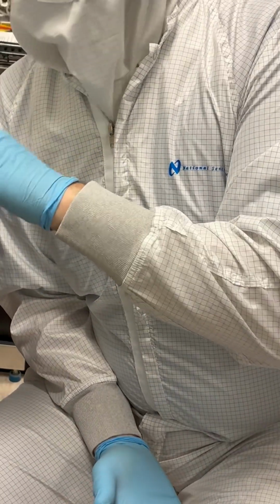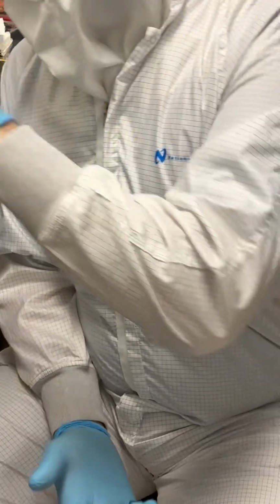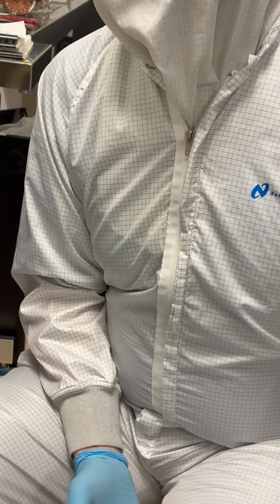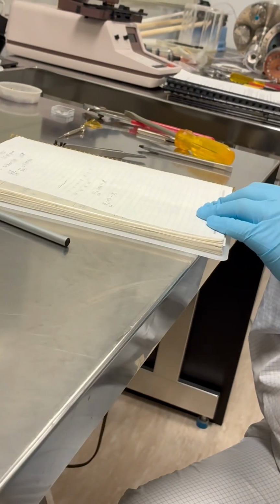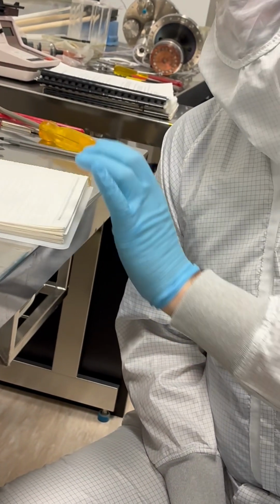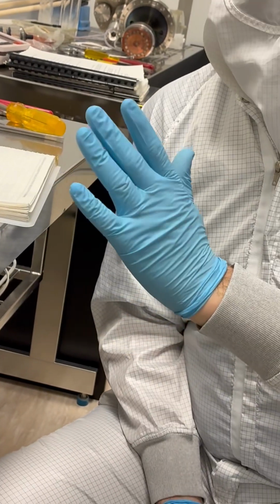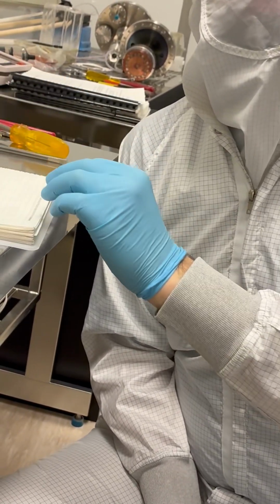And so this process should grow the same thickness every time. It's just that the number we come up with isn't a perfect number, right? So if we follow this recipe, we think we're going to grow 0.19 every single time, but maybe we grow 0.18 every single time, plus or minus a small error, but 0.18 is pretty far away from 0.19.